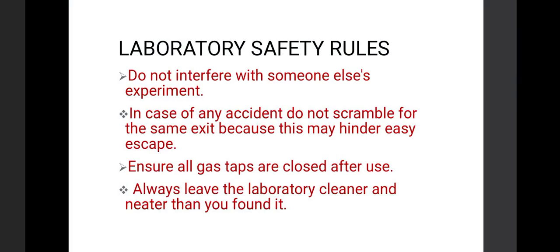Apart from that, in case of any accident, you should not scramble for the same exit. The reason behind this is that when you do so, you will be interfering with easy escape. Another rule is that you must ensure that all gas taps are closed after use. And finally, you must always leave the laboratory cleaner and neater than you found it.